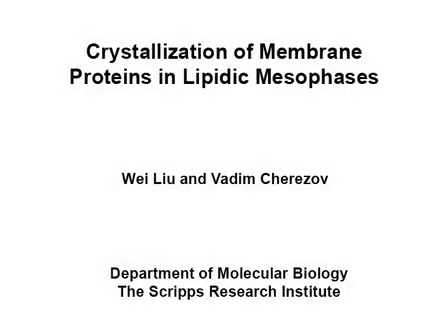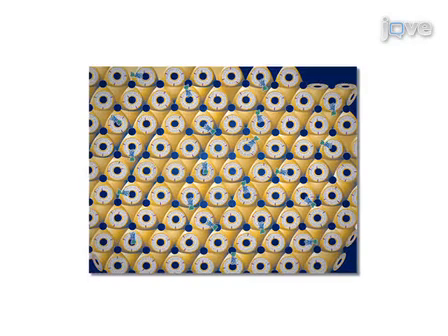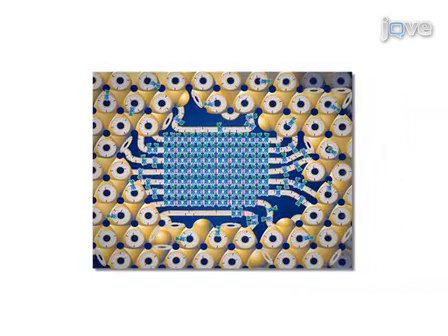The overall goal of the following procedure is to obtain high-quality crystals of a membrane protein for structure determination by X-ray crystallography. This is achieved by protein reconstitution into the membrane of a lipidic cubic phase and incubation with a precipitant solution, which induces crystal nucleation and growth.